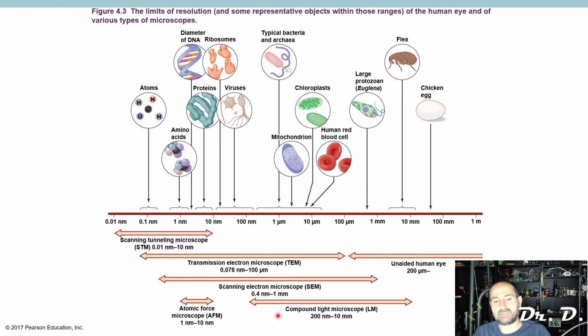So we're going to need a compound light microscope. By the way, the microscopes we use in a typical microbiology lab are called light microscopes or compound light microscopes because they have a series of magnifying lenses, right? Do you know the maximum magnification of the microscopes we use in the lab? Do you remember the magnification of the ocular, the eyepiece? Remember, the eyepiece has a magnification of 10x, right? And what's the magnification of the objectives? Remember, there's a 4x scanning objective lens, a 10x low power objective lens, a 40x high power objective lens, and isn't there a 100x oil immersion lens as well?